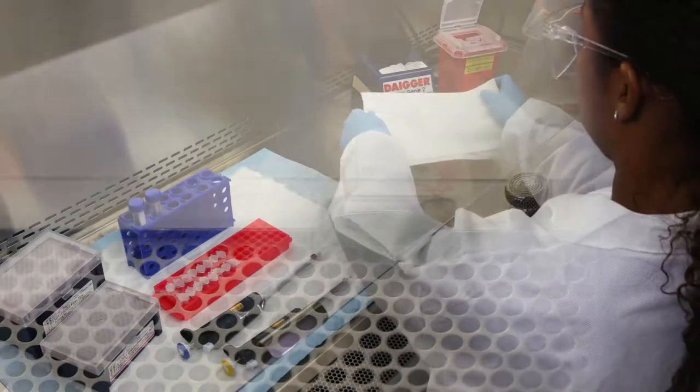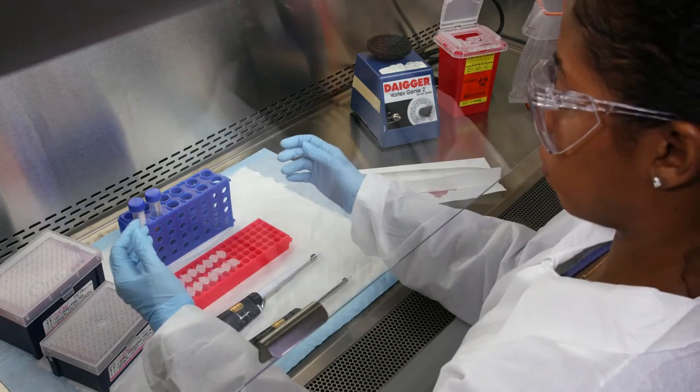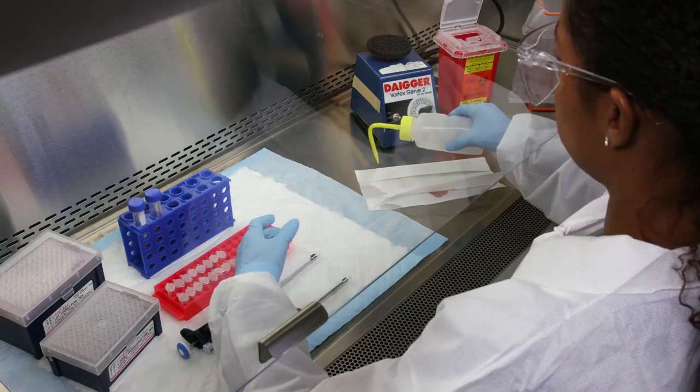The following demonstrates a general procedure for small spills that occur on the work surface. This procedure may need to be adjusted according to the specific work being performed and your laboratory SOPs.